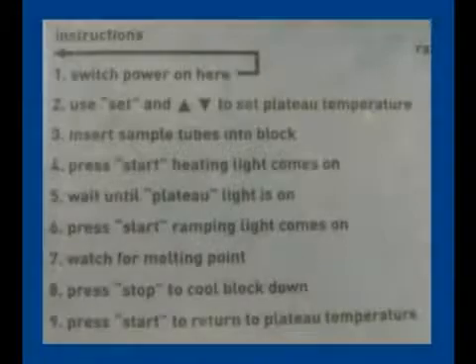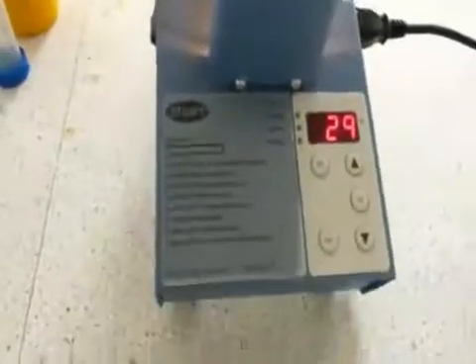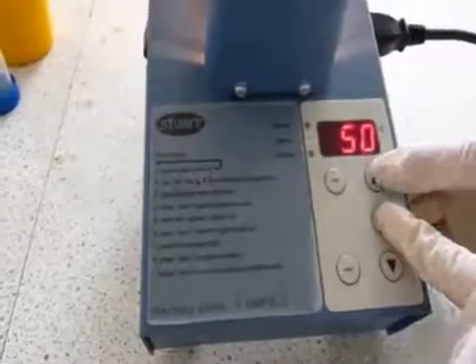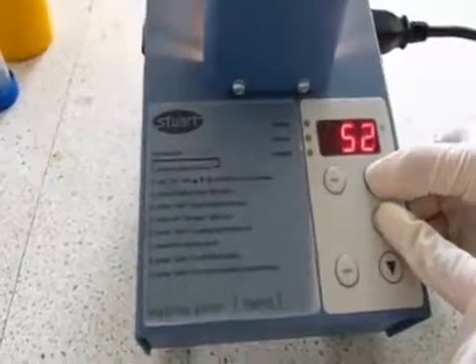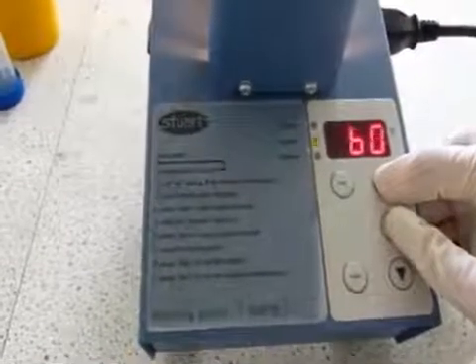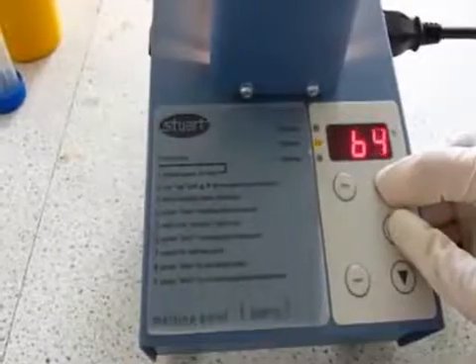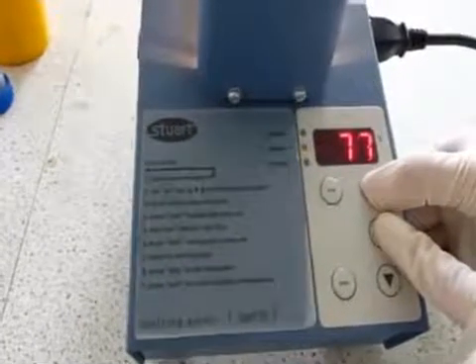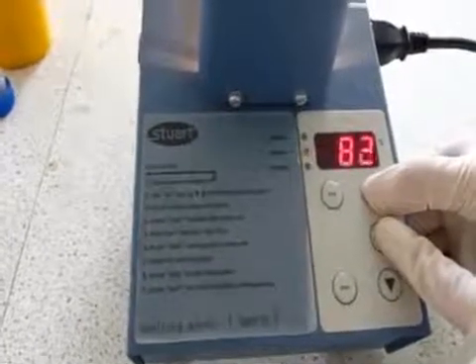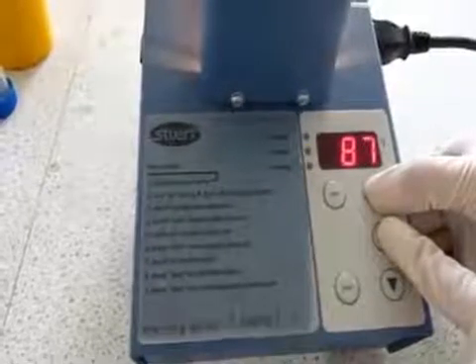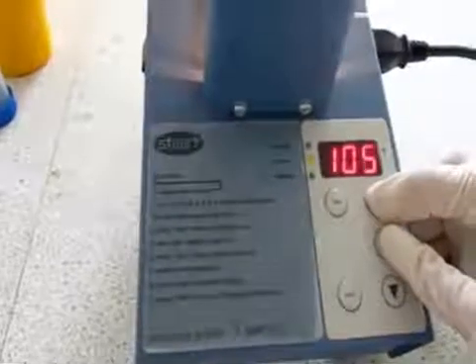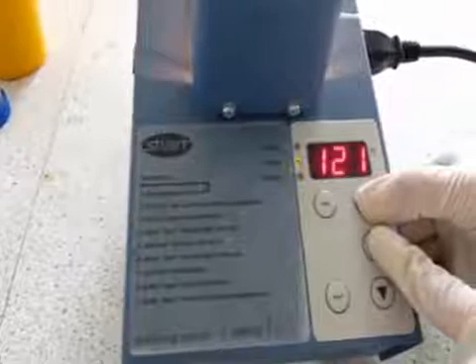Now follow the instructions printed on the side of the melting point apparatus. Using the set and up or down buttons together on the apparatus, select the plateau temperature, which will be given to you in the lab. The plateau temperature must be about 10–20 degrees below the actual melting point of your sample.